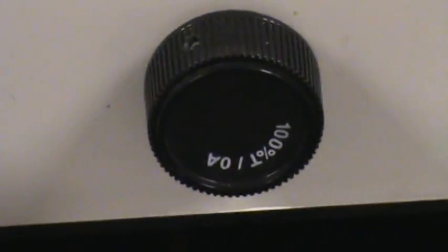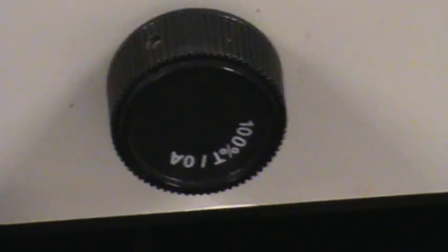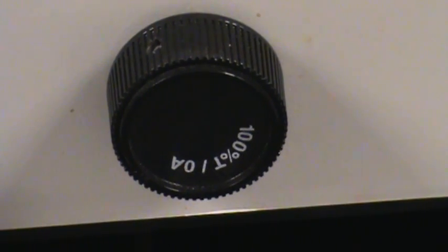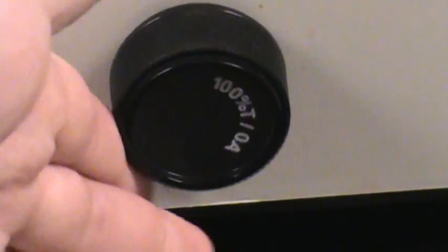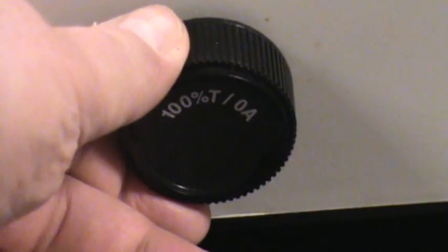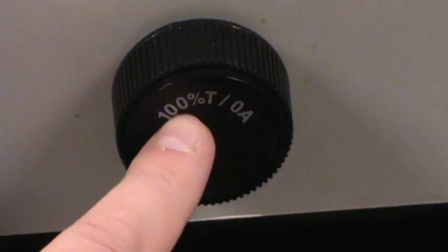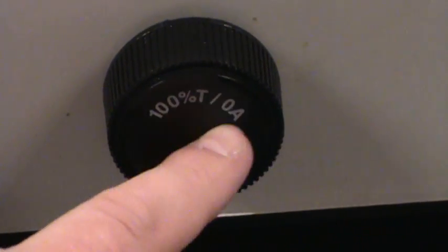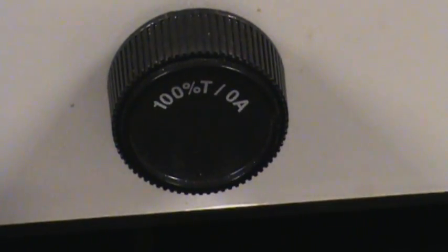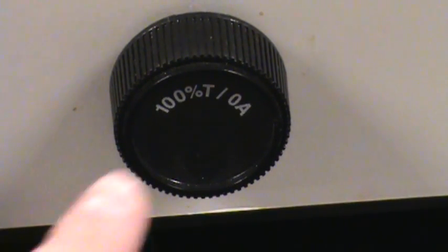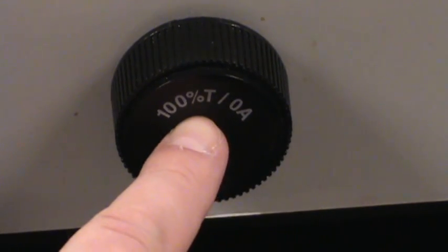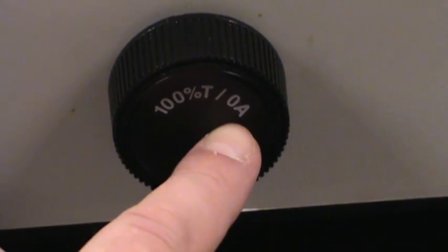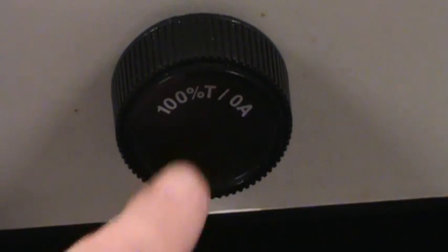The other dial on the front of the spectrophotometer is 100% transmittance 0% absorbance. So we can turn this so we can look at it. Percent transmittance and absorbance are just different ways of describing how much light either is transmitted by a sample or is absorbed by a sample.